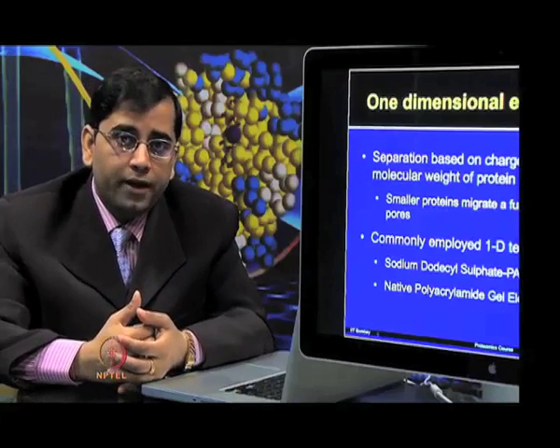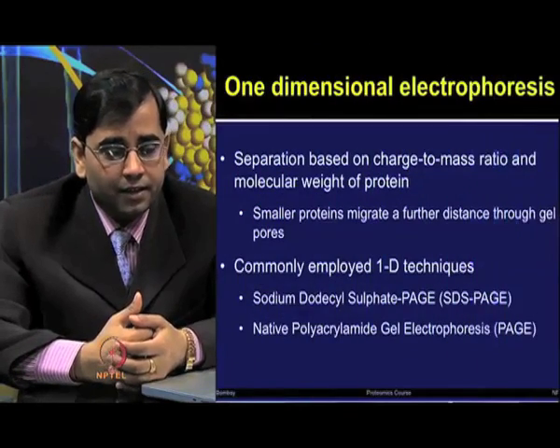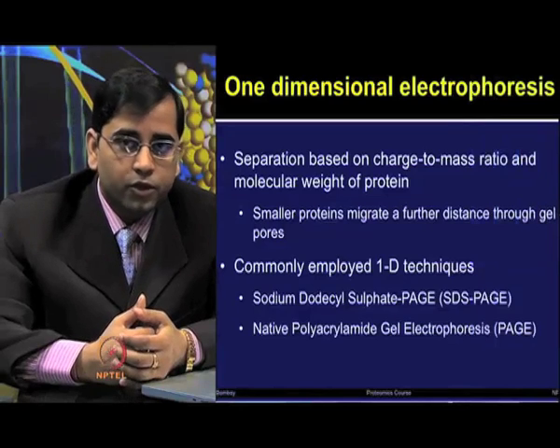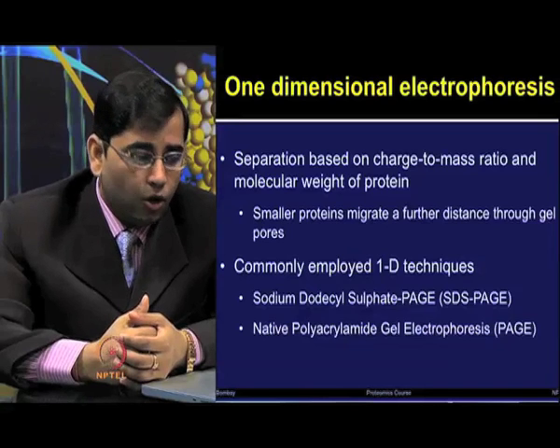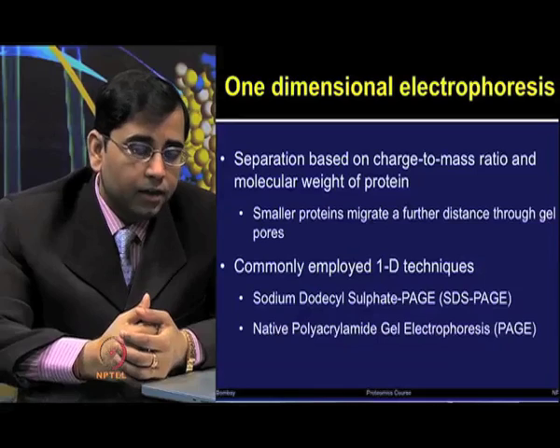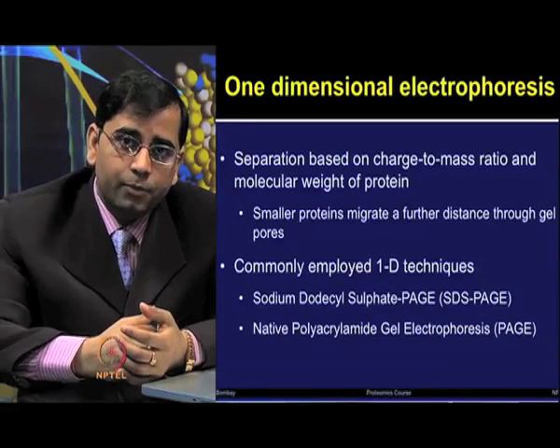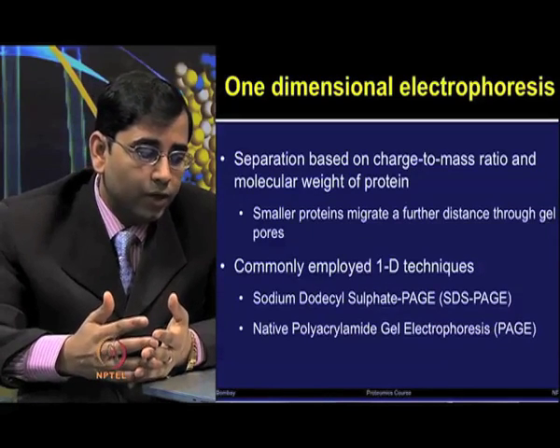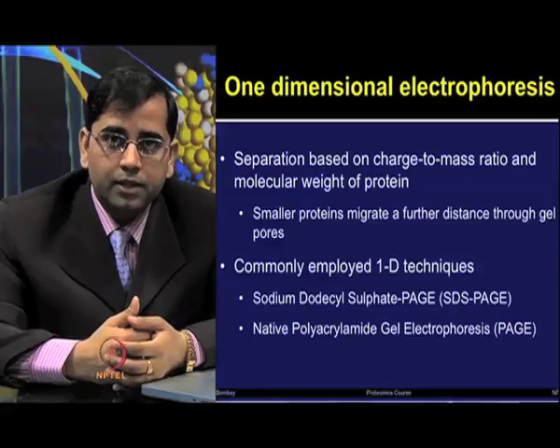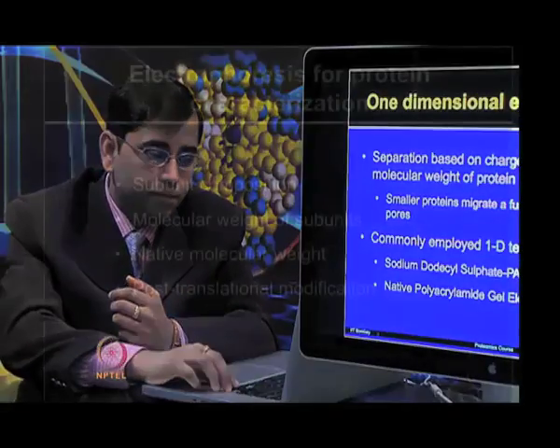So commonly employed one-dimensional techniques include sodium dodecyl sulfate PAGE, SDS-PAGE, or another technique which is used for studying the protein in the native conformation, native form, which is known as native polyacrylamide gel electrophoresis or native PAGE.